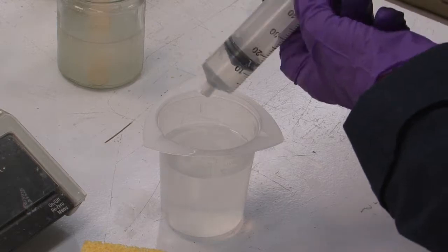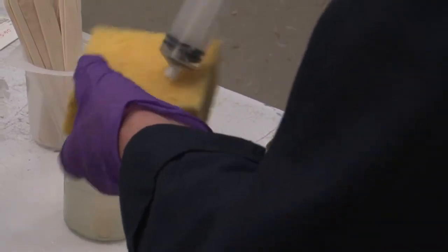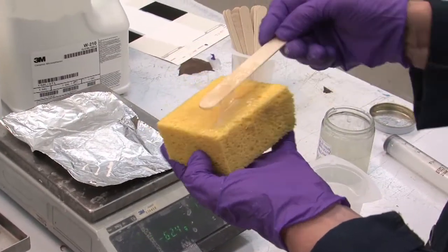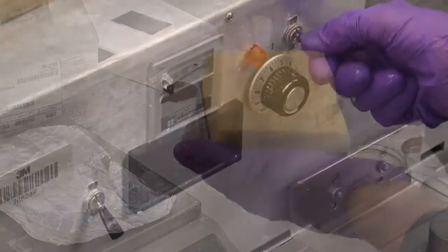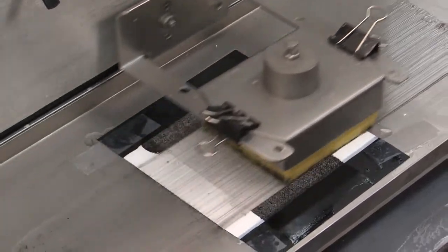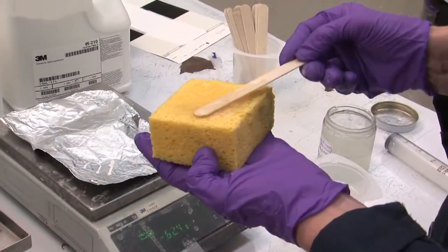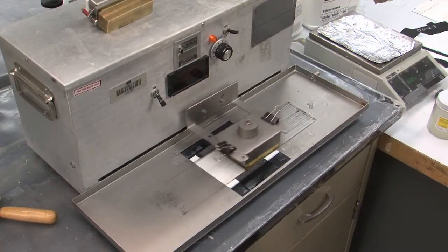We precisely measure the amount of standard non-abrasive liquid cleanser applied to the sponge. We run the test for 25 passes. Then we thoroughly rinse the sponge and reapply the cleanser. This process is repeated 4 times for a total of 100 cycles.